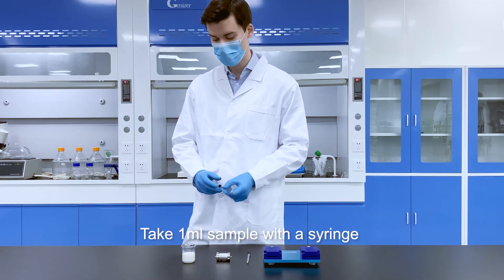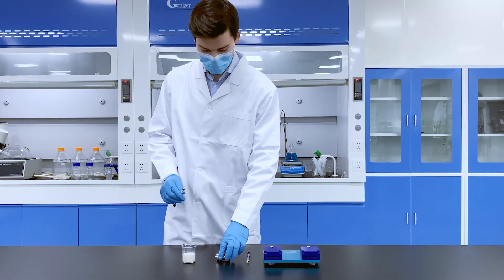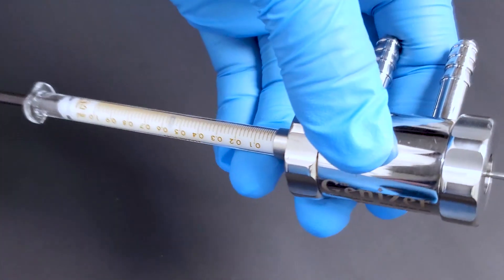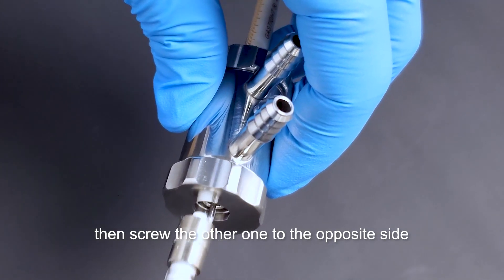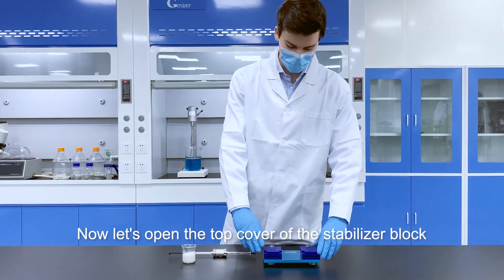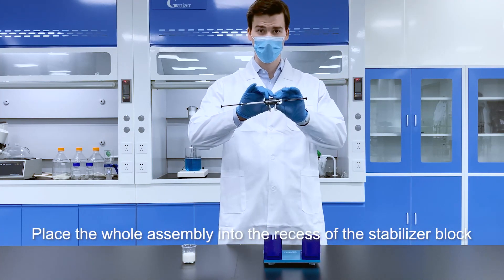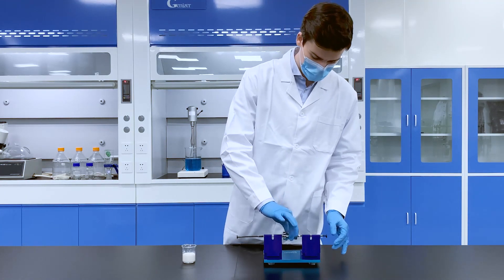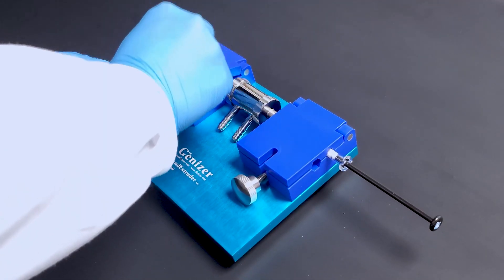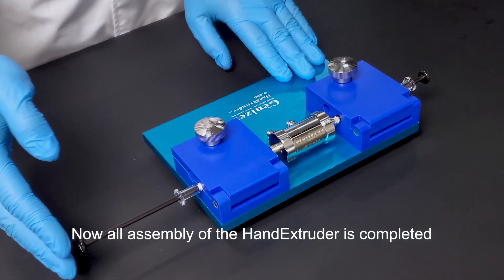Take one milliliter sample with the syringe and screw it to one side of the metal body. Then screw the other one to the opposite side. Now let's open the top cover of the stabilizer block. Place the whole assembly into the recess of the stabilizer block, put the top cover on, and tighten the nuts on it. Now all assembly of the hand extruder is completed.